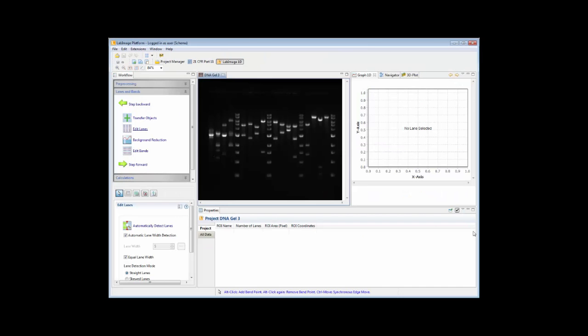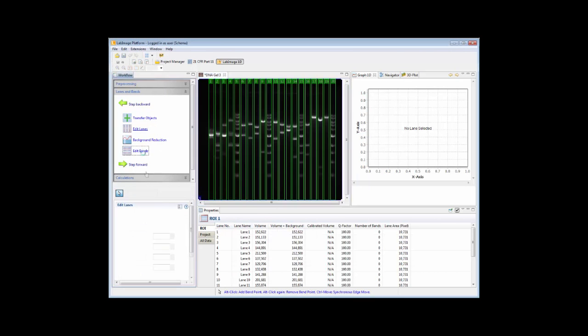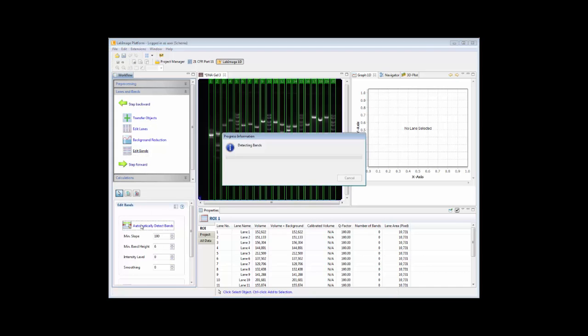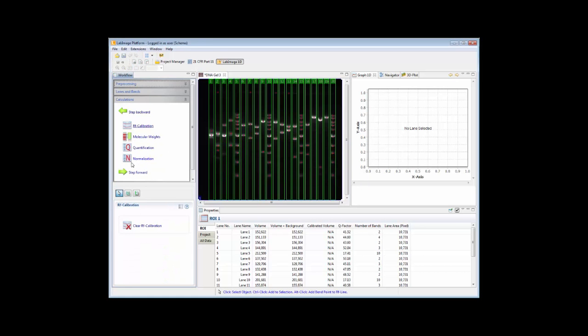As I mentioned before, working with LabImage is very easy. It is workflow guided, so you just follow each step as detecting lanes, detecting bands and so on, and all these actions that you take will be documented in the audit trail.